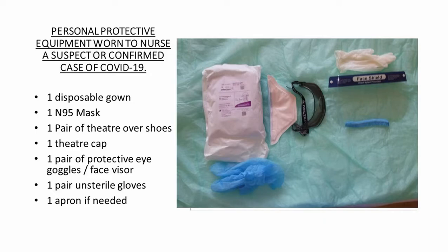This is the equipment we are wearing when wearing the full PPE. The first is a disposable gown — the theatre gowns worn by doctors in theatre. An N95 mask, a pair of theatre overshoes, a theatre cap, a pair of protective eye goggles or face visors. The visors are in short supply, so we're using the goggles. Goggles are reusable and disinfected between use; if using a visor, it is thrown away. Then a pair of unsterile gloves and an apron if needed.